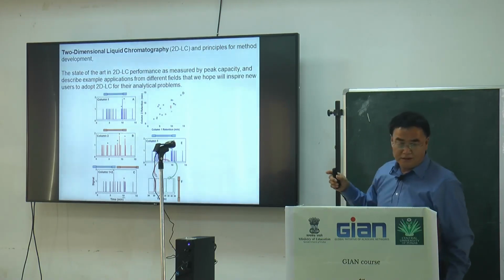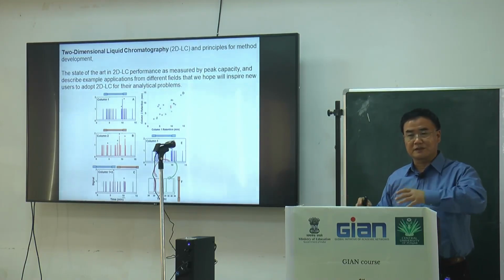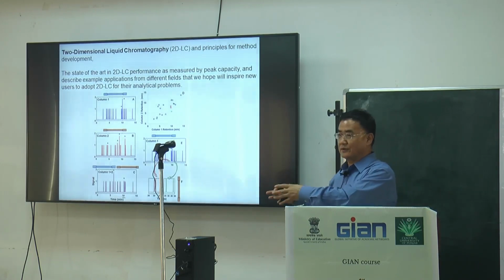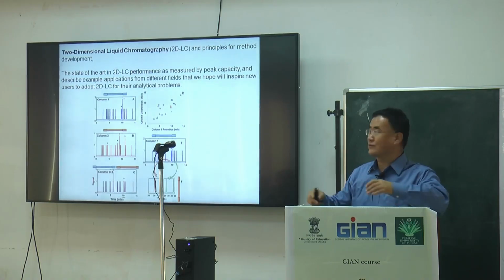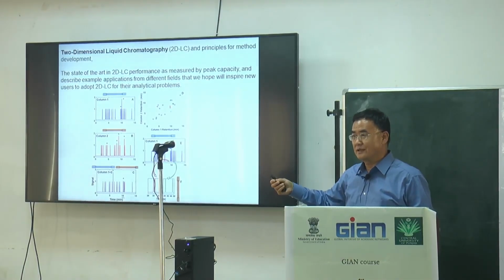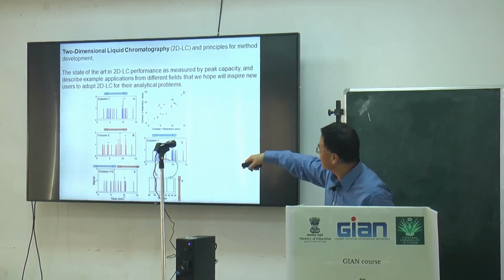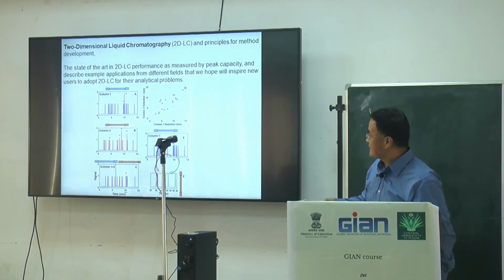New methodology development also considers the separation part, because separation is very essential. If you have a more accurate or clearer separation, for example UPLC for liquid, or GC, or two-dimensional GC, which I will talk about later, the separation will be much more efficient.